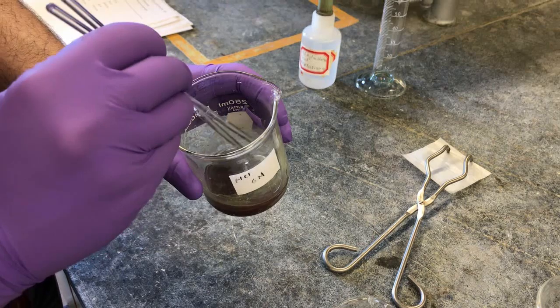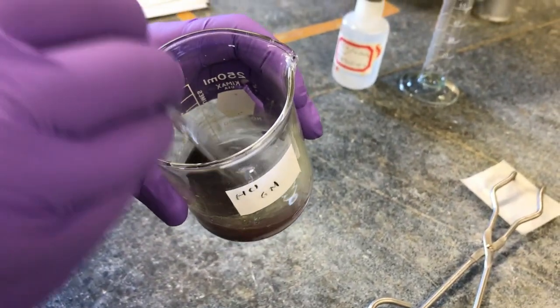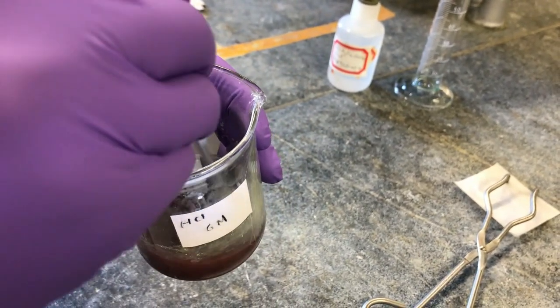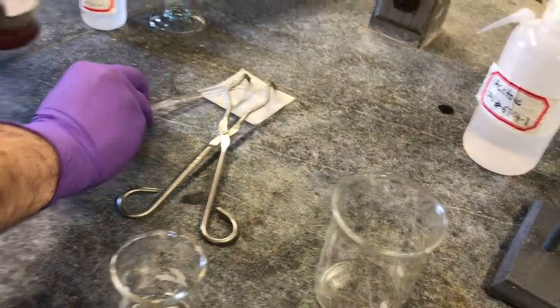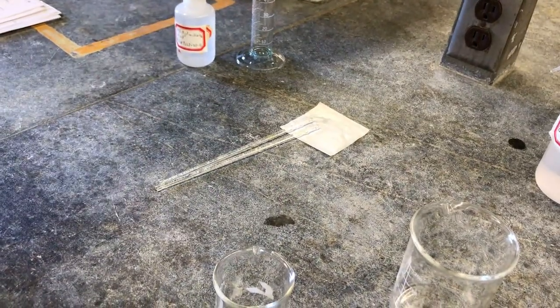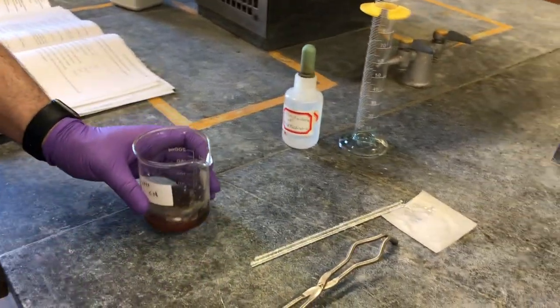Notice that it looks like a lot of the chunks are sticking together. Make sure that these are pretty clean so that nothing comes out. And then we're going to grab this zinc piece with our tongs. And actually, let me get a piece of paper towel first.